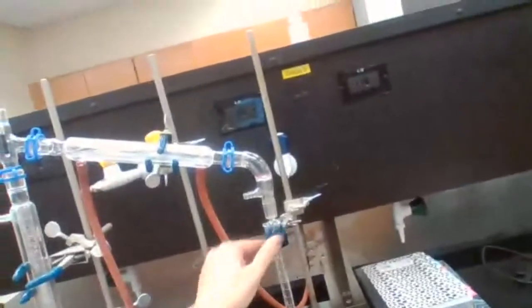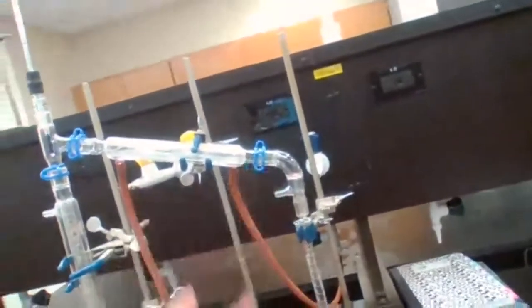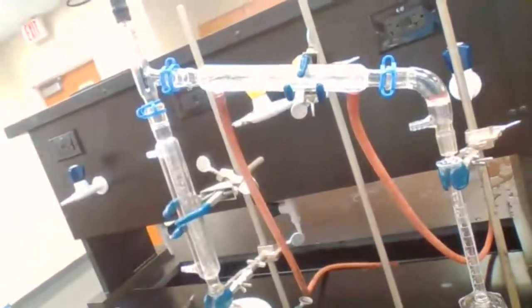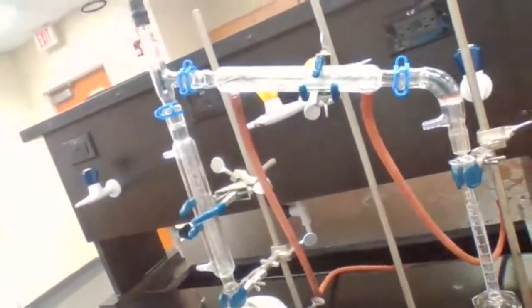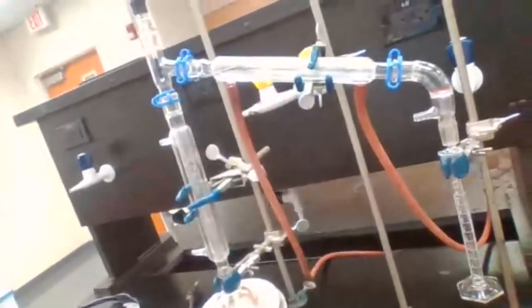The receiving graduated cylinder is at a higher level because we had to bring it up to reach this. The flask, I'm going to open this flask, clean it, get the new chemicals in, add the boiling chips, and place it back. So I'm not using it the way it is right now. I'm going to clean it and add the chemicals that I need for fractional distillation, which are the same, because we want to compare the two methods. And then I will put it back, turn on the water first, and turn on the heat. So let me get the chemicals.